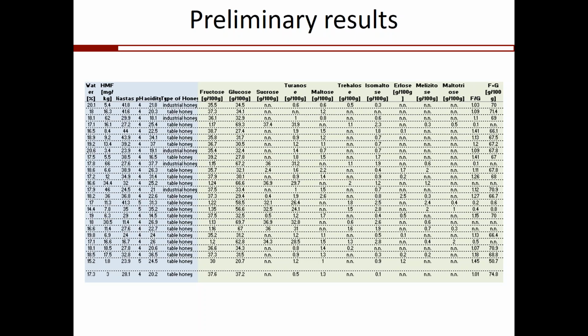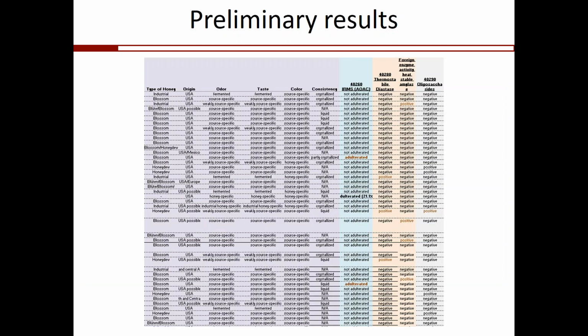That should be around 70%. And then they have results based on that, like whether or not the diastase was positive or negative. If they found a positive hit, that means the sample was heated to an extent and processed that way, etc.